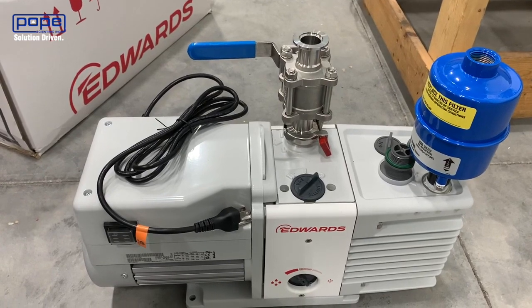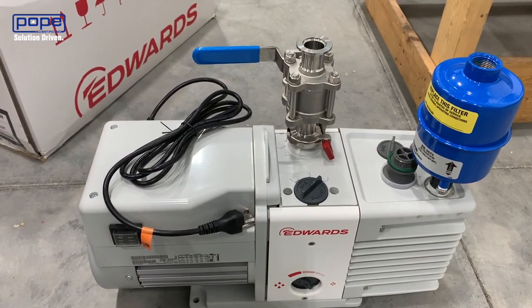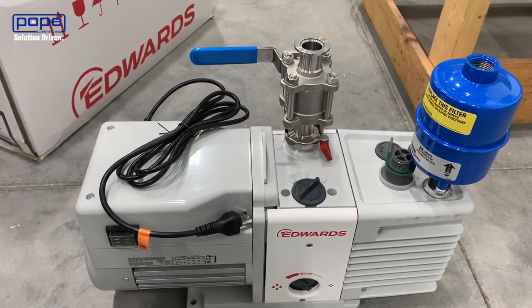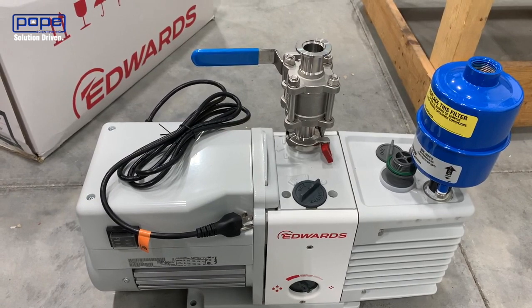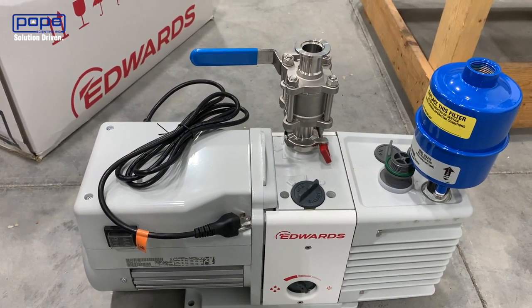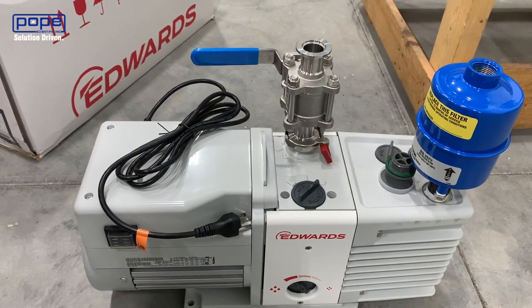Mechanical rotary vane vacuum pumps are used in many processes. These vacuum pumps are sealed with oil that sits between two rotary vanes. When dealing with processes that may have volatile materials, those volatile materials could end up in your oil. When they build up in the oil, it actually decreases the ultimate vacuum achievable by the vacuum pump, because that oil is constantly vaporizing.